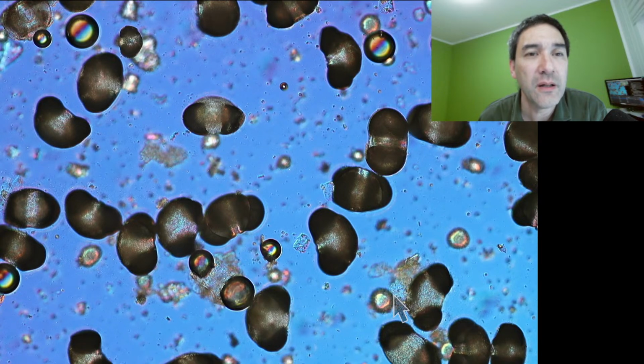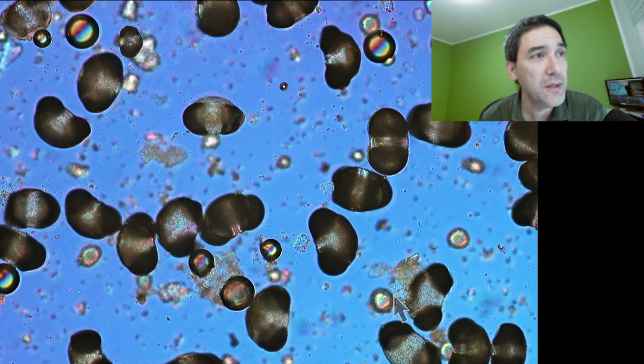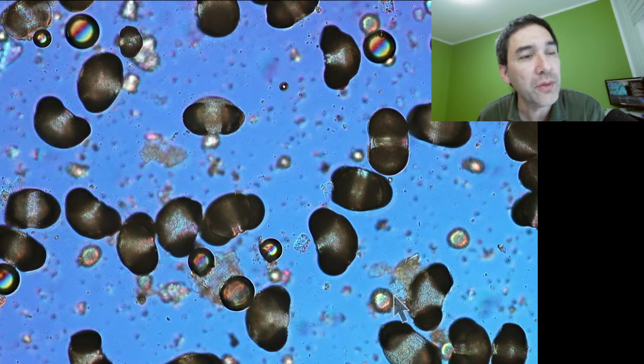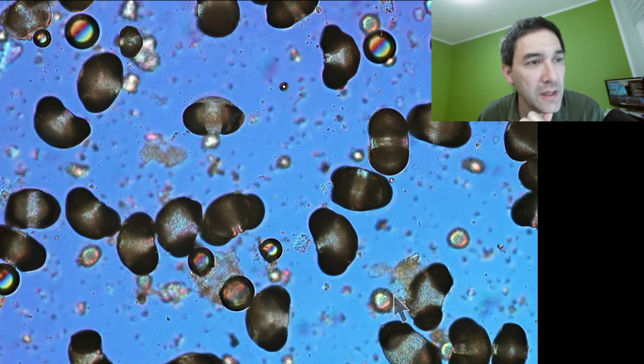Those pollen are split in two. Does this mean they're sprouted? No, because that's also a good point here. No, that is the way that they actually look. Pollen will not sprout like this. They will form a pollen tube. In that sense, pollen are different than seeds. I think that's where the association comes from. I'll just show it to you again here.